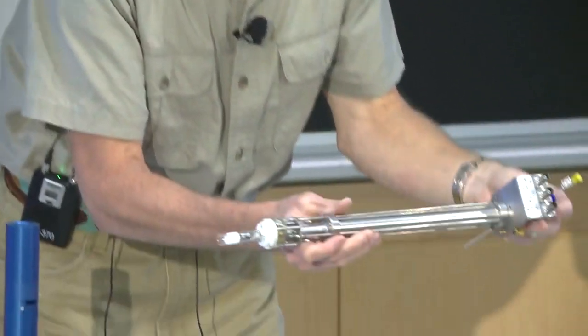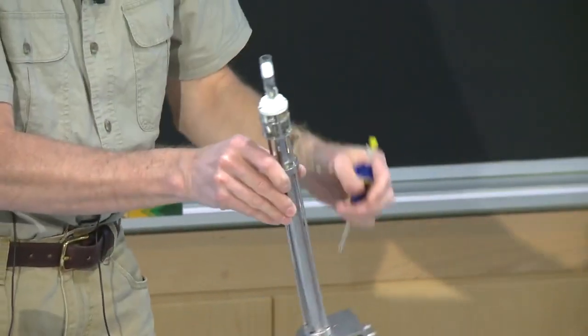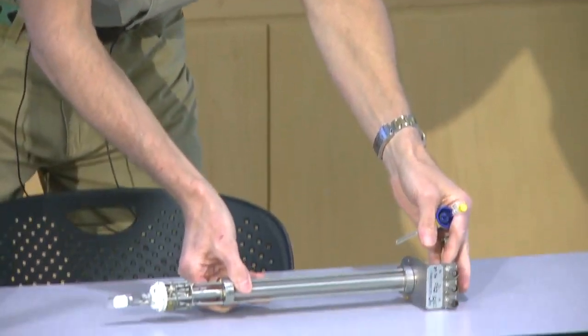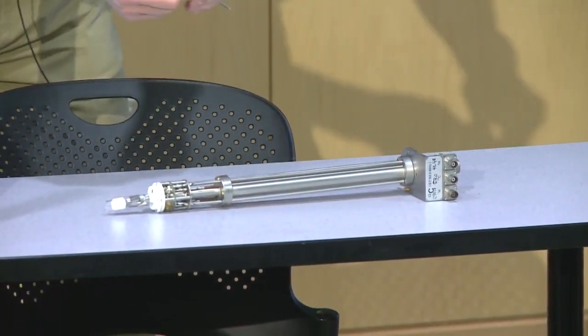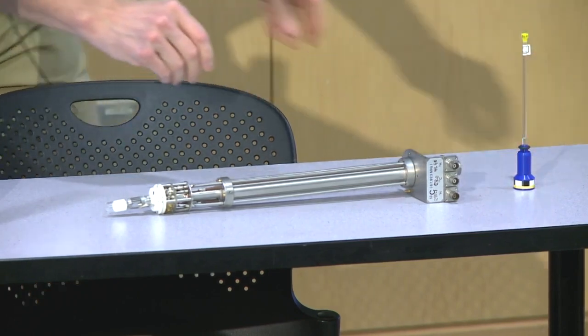So I will leave this right here. If you come up later to look at it, feel free to pick it up. Just be very careful. This is glass, and you don't want to bang on it or bend it because you can break it. Not that it's working anyways anymore, but we like to have it for demonstrations.